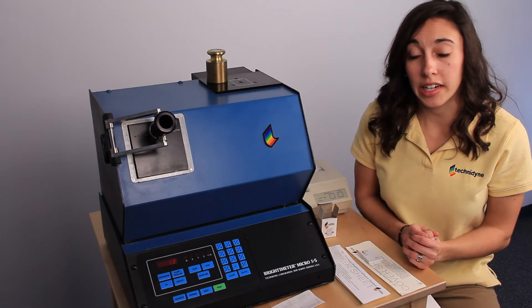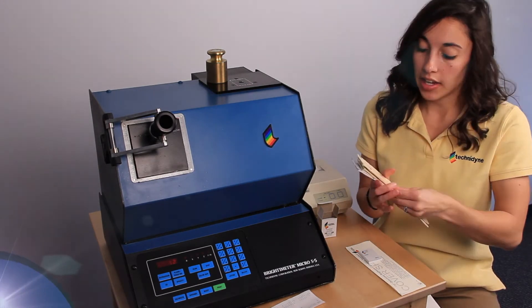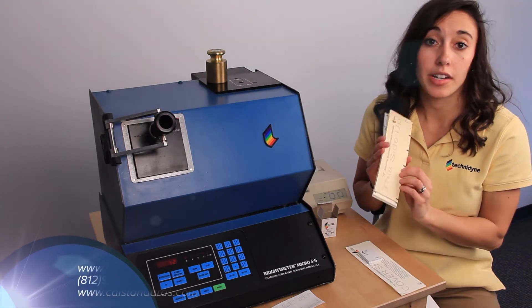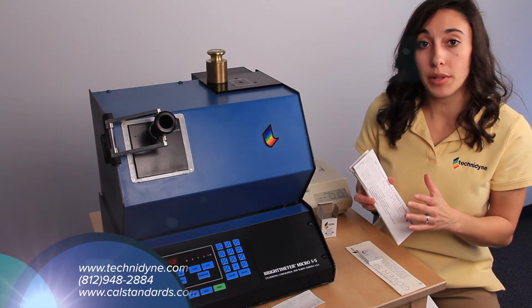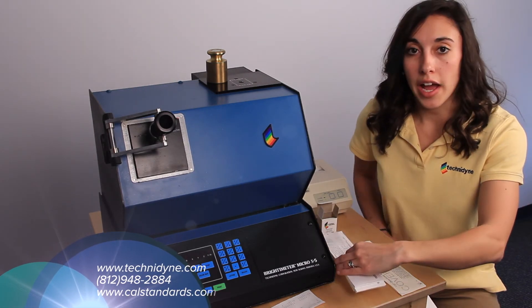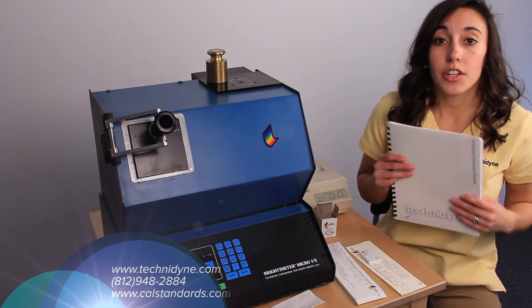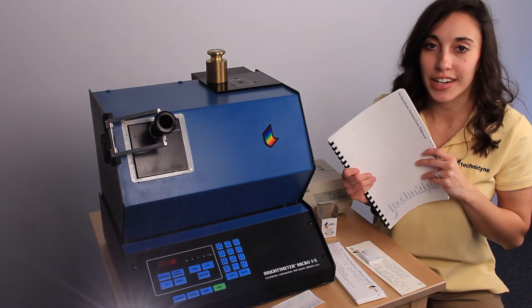In order to verify measurement linearity, you can take the last four sets of verification standards and measure each of the five positions across the standard. If you take the average of those five positions, they should be within plus or minus 0.3 of the average given to you on the printout. If they're not, or if you have any other questions, you can refer to your Technodine operator's manual, call Technodine, or check out the website.